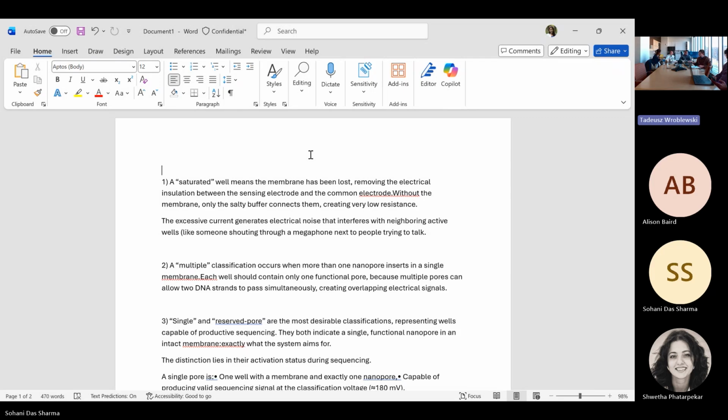Through my experiments, I feel like this is working best for me. The purpose is that it should not introduce an air bubble. Yeah, that's why we were very worried about the air bubble. So you can do it like this, then you still have another drop here, and you just take it off like this. Or you can do it straight, or at another angle. I don't think that's going to change anything.